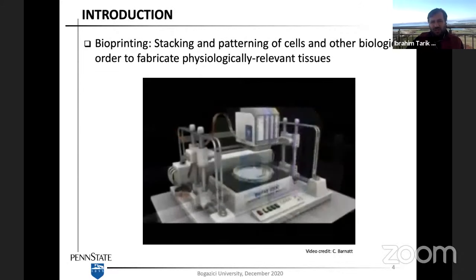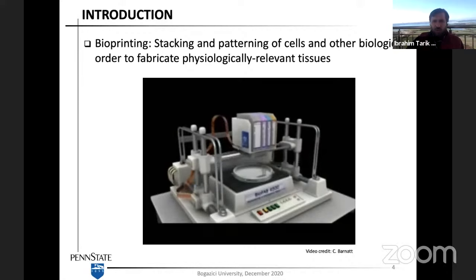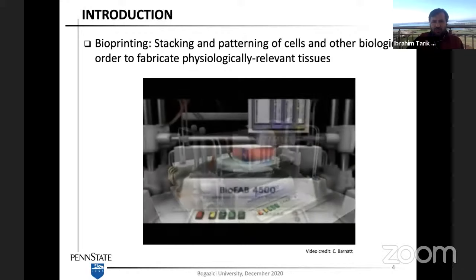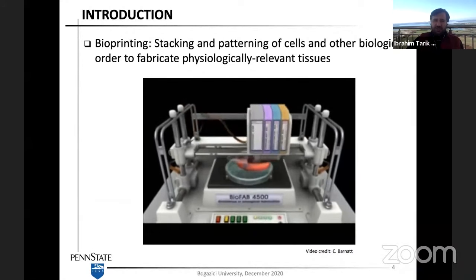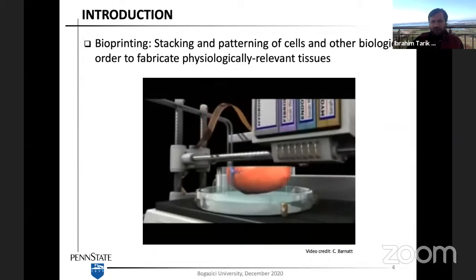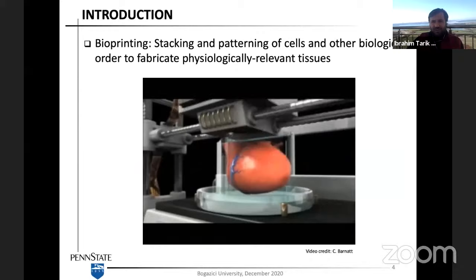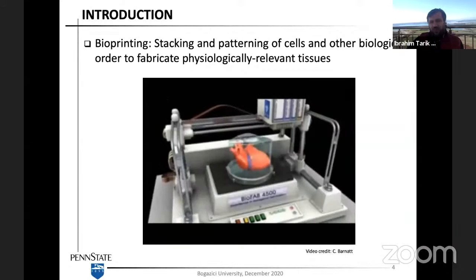So here is an animation of bioprinting. This is not real, it's just the animation. What we do with bioprinting is we put the living cells in the cartridges of a 3D printer, and then we deposit the living cells in materials like hydrogels. Those materials are biomaterials, and we deposit the cells layer by layer, precisely, and then we build a structure. Over time we expect that the cells organize and remodel the tissue, and eventually we get a tissue that could be readily available for transplantation. What you see there is a heart being printed with vasculature, multiple cell types, and in the shape of the real heart of a patient that could be readily available for transplantation, but we're not there yet.